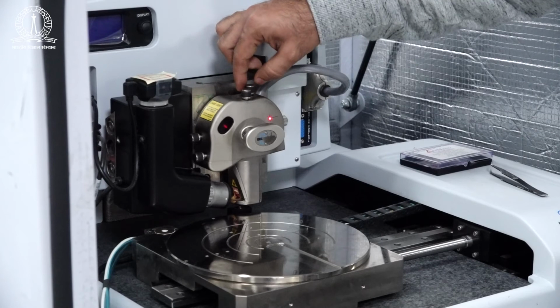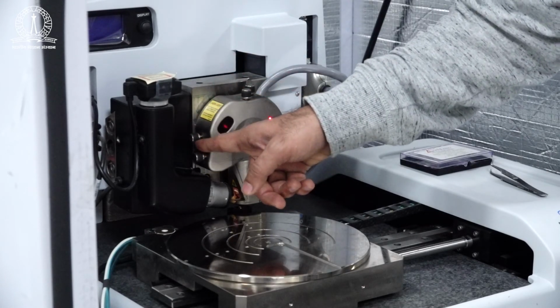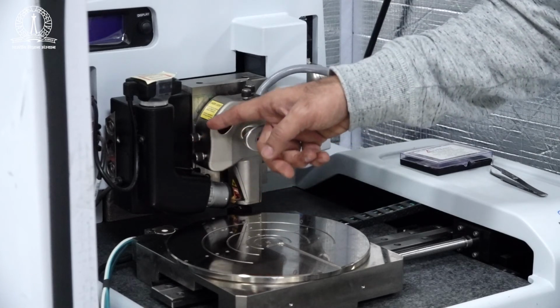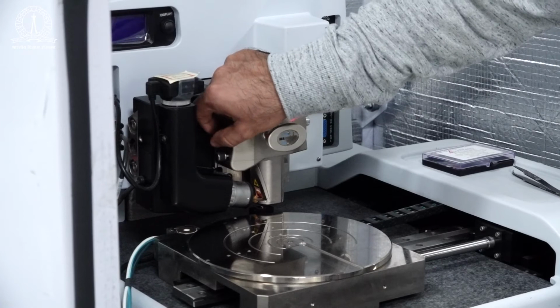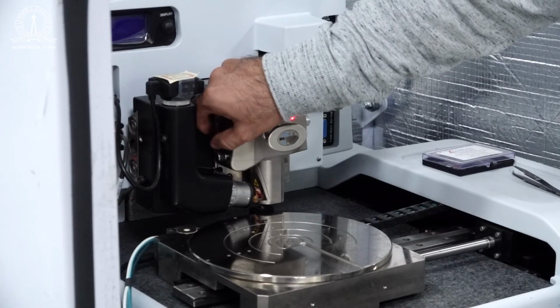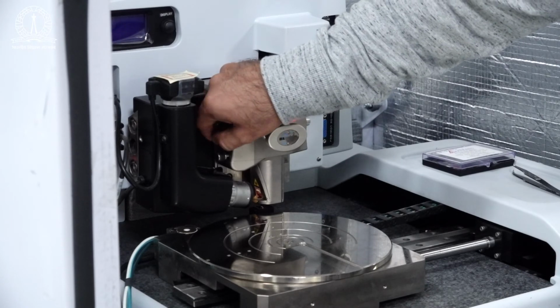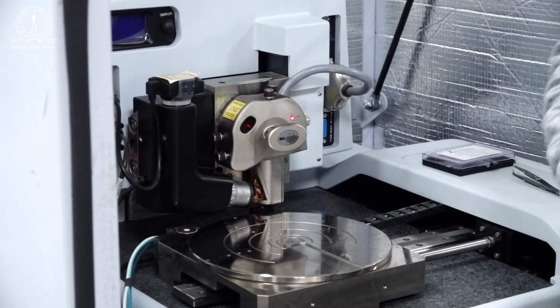Once that is done, we move to the other two knobs here on the side. These are to adjust the spot on the detector. So rotate them such that the spot moves to the center. Once the spot has moved to the center, the next step would be to get our focus on the actual cantilever position.